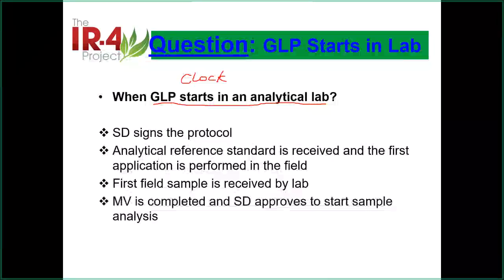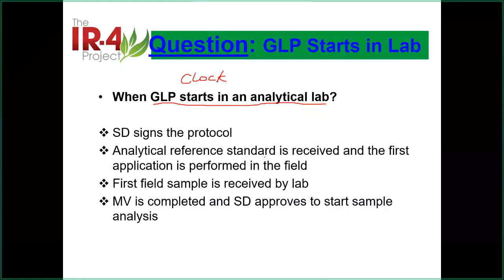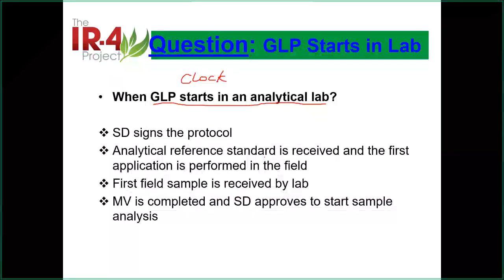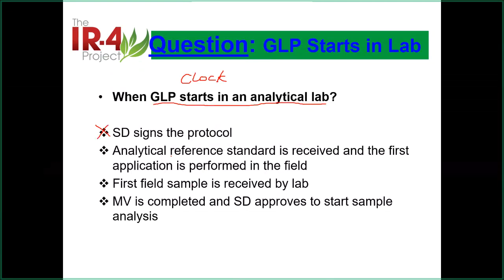Okay, we put some answers there. Of course, when the SD signs the protocol, the whole study starts, not the lab only. Okay, the whole study, everything is starting. But in the lab, I don't have samples, I don't have standards, I don't have a method, I cannot do anything GLP. So in this part, I don't have to do GLP, which is correct. So the first one, that's not a correct answer.